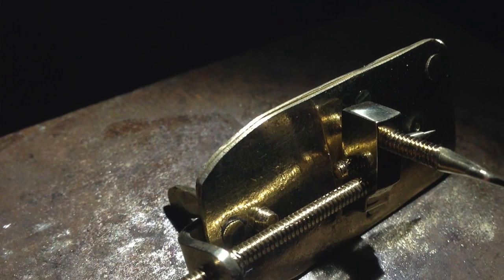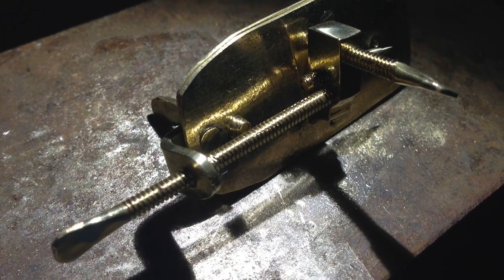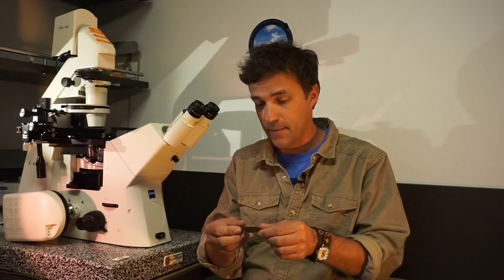Leeuwenhoek's microscopes were actually fairly complex. This is a replica of one here. It's made of brass, has a glass lens, and a sophisticated little mechanism to hold the sample and to focus and so forth. He made hundreds of these and they're very complex to make. So what we're going to do is we're going to make a microscope that functions very similarly, but it's a lot easier to make and it's made out of very simple materials.